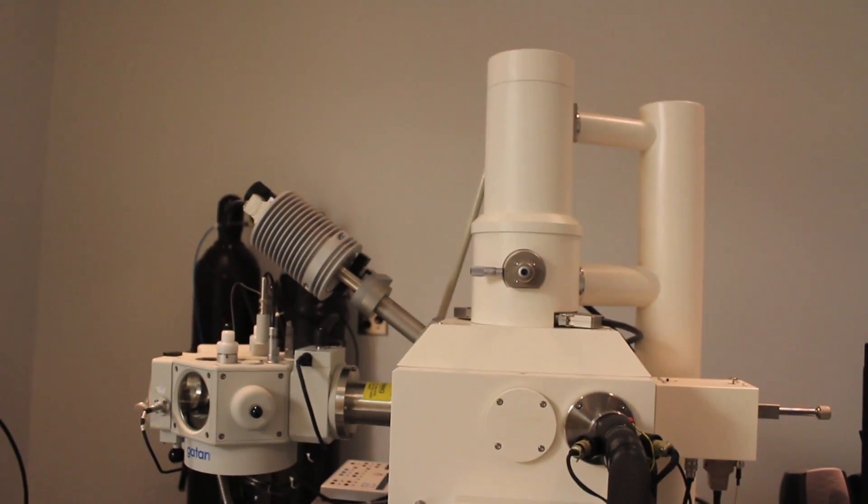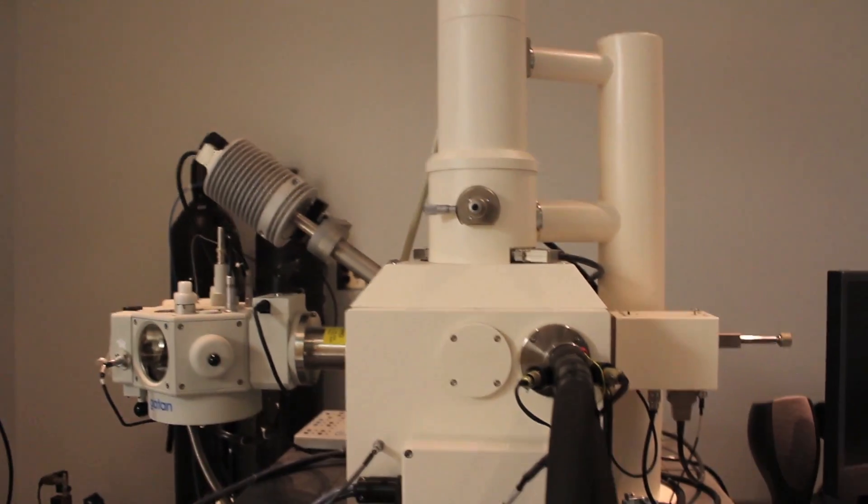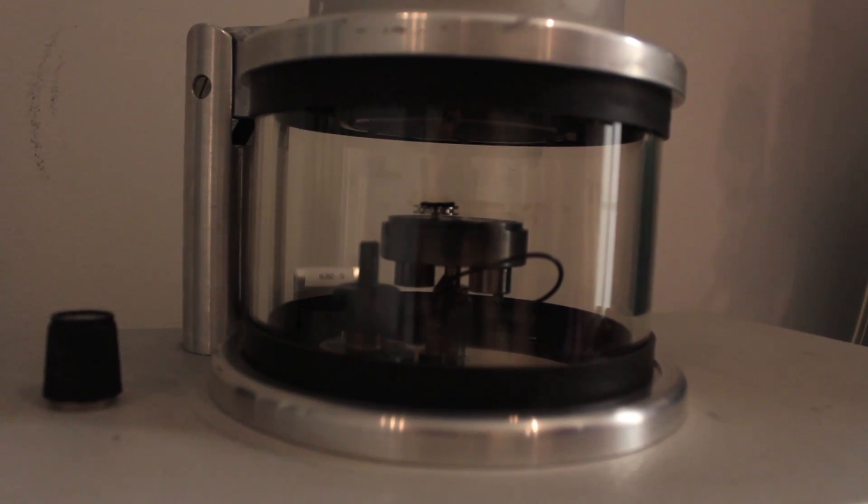On the scanning electron microscope, we're going to be bombarding it with electrons and you're going to have this huge charge difference. But the problem is, butterfly wings are insulators. So we have to discharge that voltage, or I guess it's just potential, we have to discharge that back to ground. And the way we do that is we have gold all over the butterfly wing so that it has a path to ground.